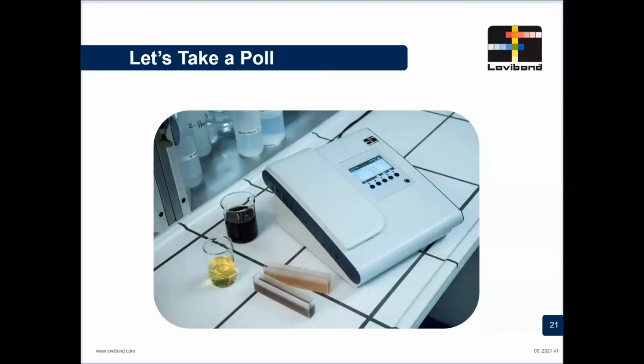Looking at the results, most people are using either a Model F or a PFXI currently, with most people who are carrying out the measurements being in quality control. And how often do we reread our edible oil color measurement procedure? Most people have selected every 1 to 6 months.